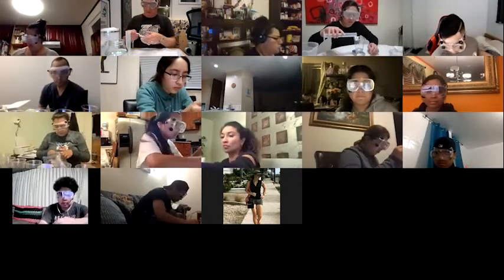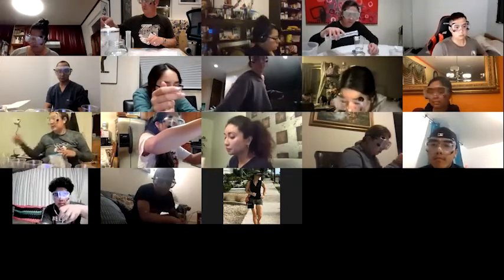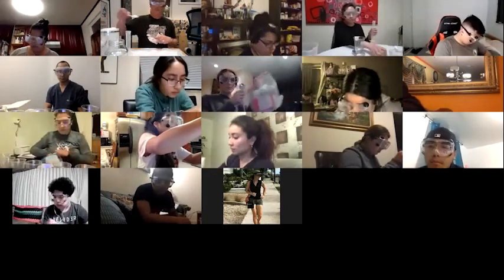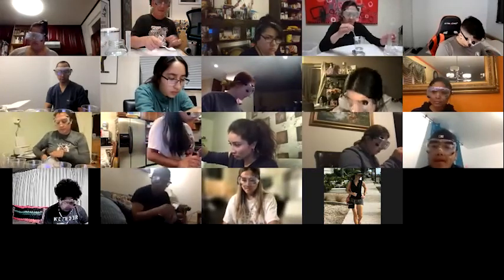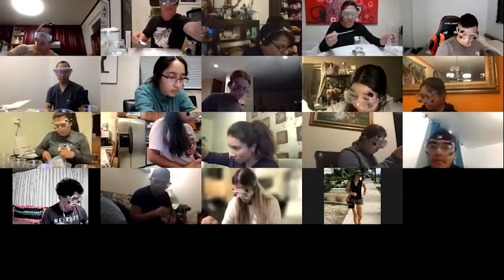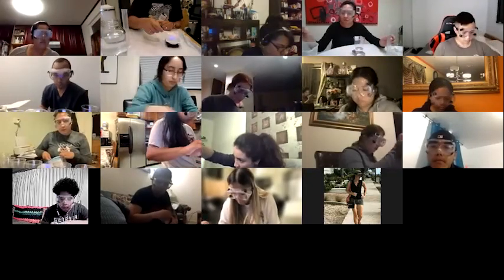Here's my clean spoon. Take your scoop. Now, gently tap. See if I can zoom in a little bit. You want to gently tap.